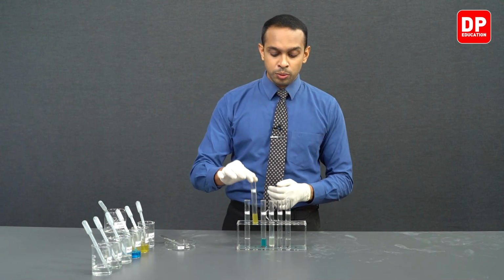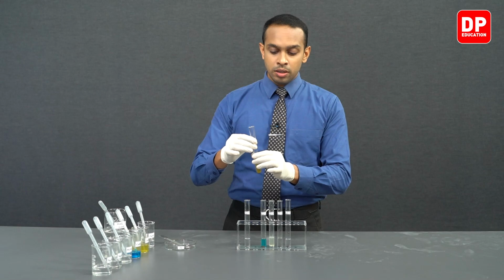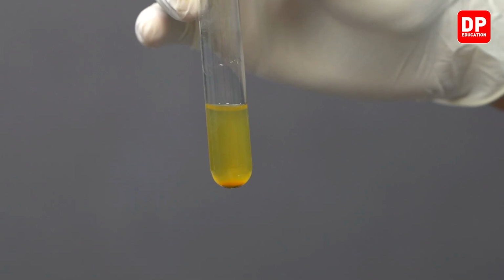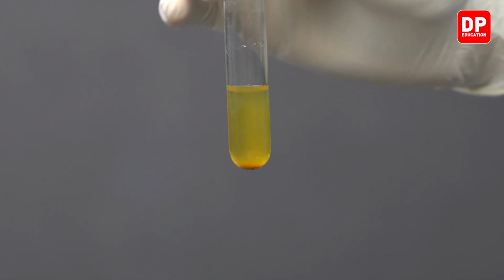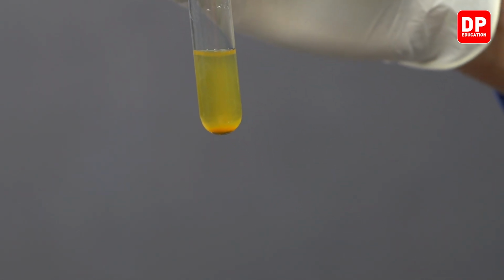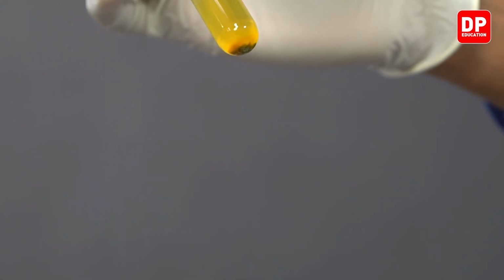Then we move on to Fe2+ or ferrous sulfate solution. And when added with zinc, you can very clearly observe there has been some reaction going on at the bottom of this test tube.